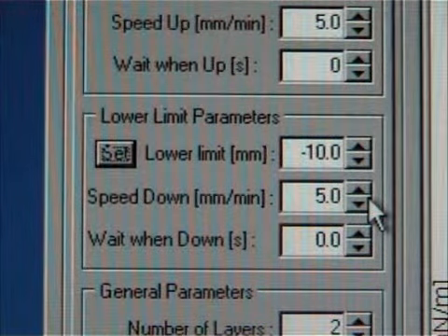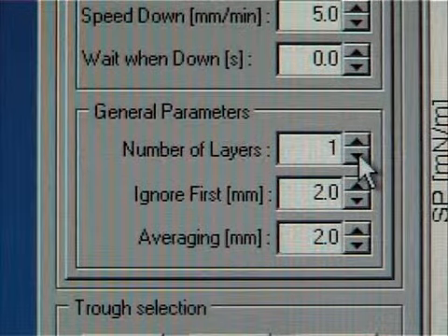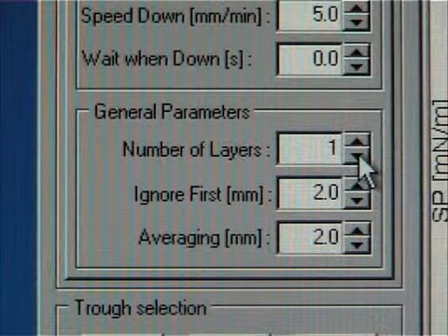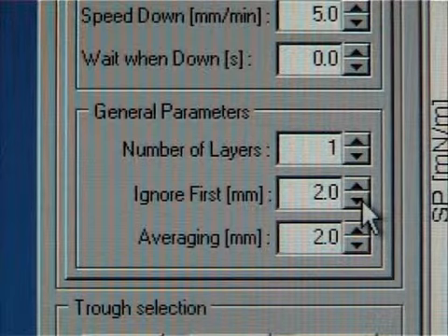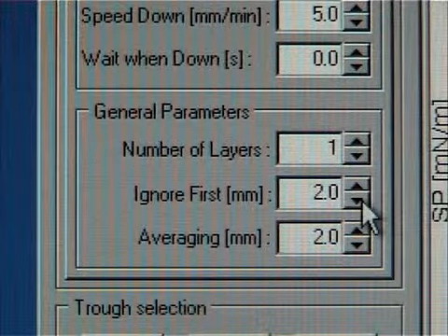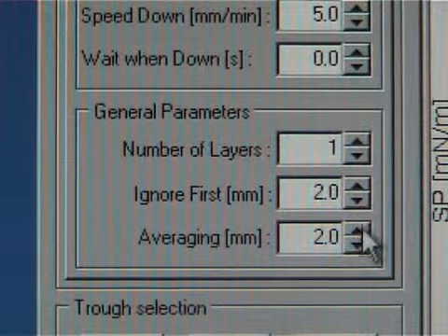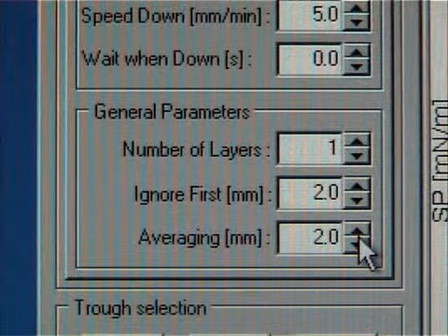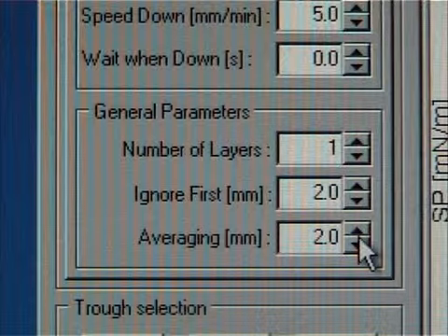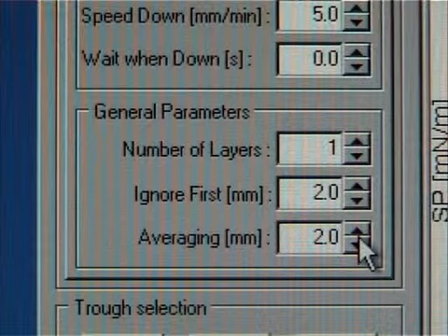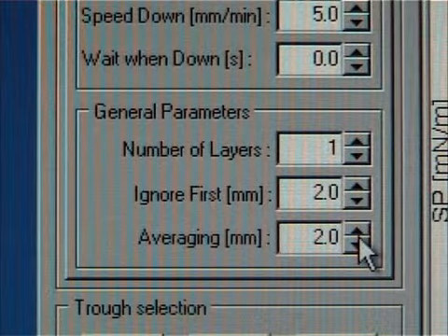The wait when down value can be left to zero. Number of layers is set to 1 because now the sample is only lifted once from the subphase to air. Ignore first means that the software doesn't take the first 2mm into account when calculating the transfer rate of the monolayer. Averaging defines the number of points that are used to extrapolate the TR value during the measurement. If it's set to 2mm, the software uses the data from the last 2mm to extrapolate the TR value on the Y axis. It is recommended to use at least 2mm to avoid high noise ratio.